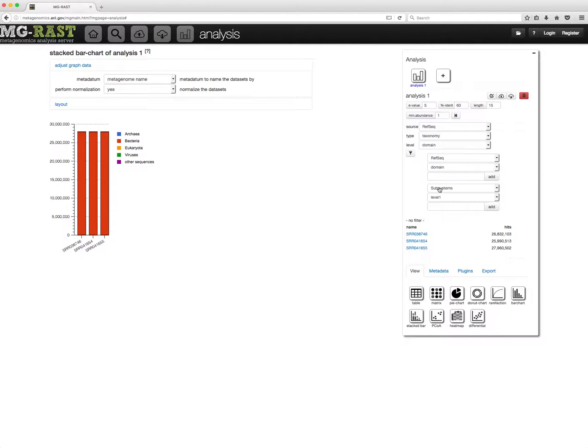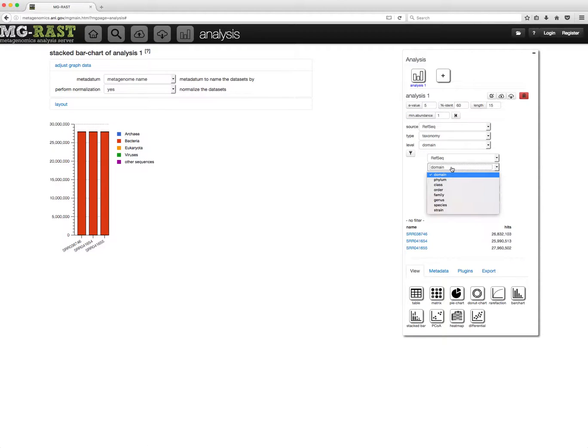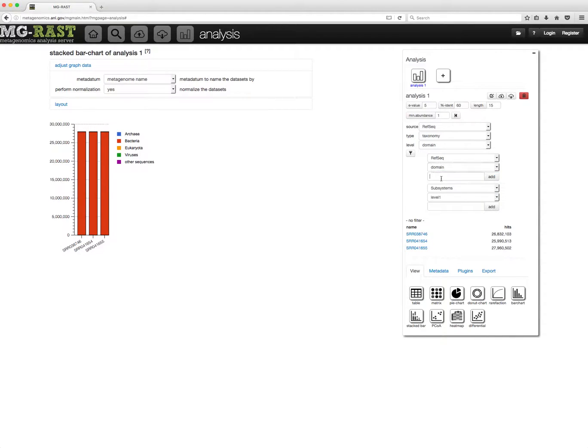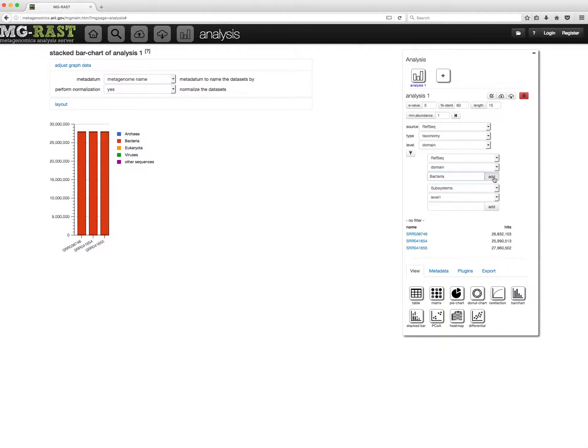To add a filter, first select the data source, the level in the hierarchy, and the filter term. Then click Add.